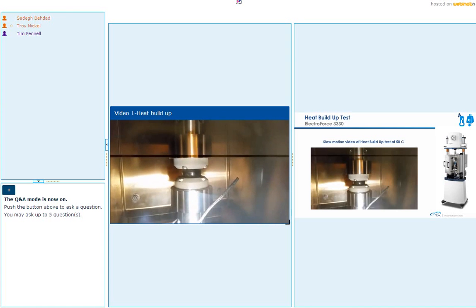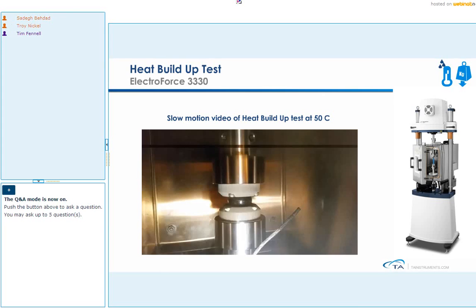You can see how highly compressed that sample is. The oscillation strain was only 12.7%, but the test dictates a mean force or a mean stress to be applied to your sample before you start oscillating around that. And that alone is gonna add an additional 30 to 35% strain to your sample. So it's a very aggressive test, and we are going to compare the results of 3 different specimens.